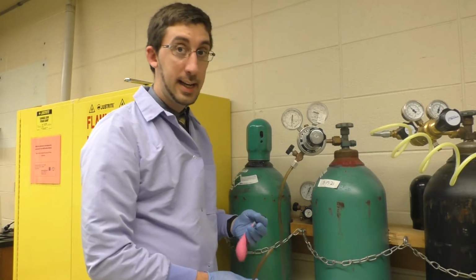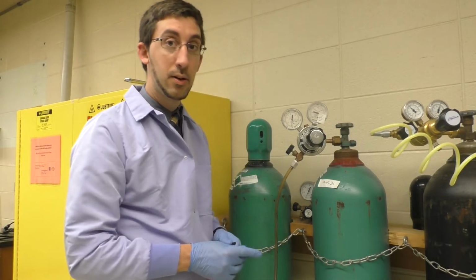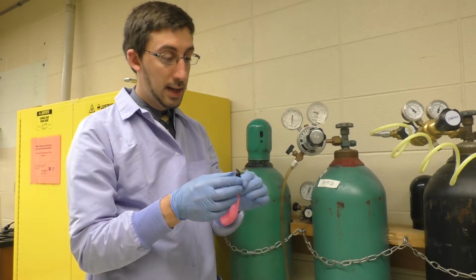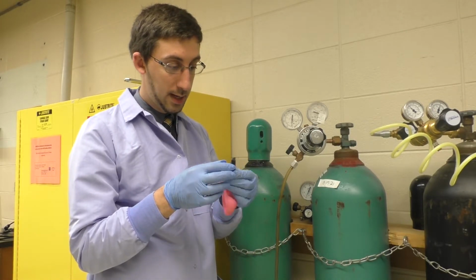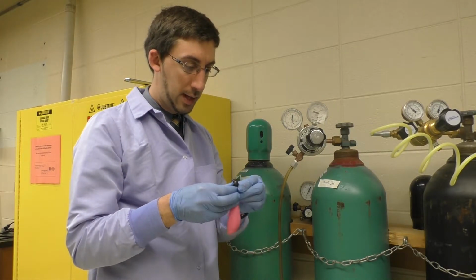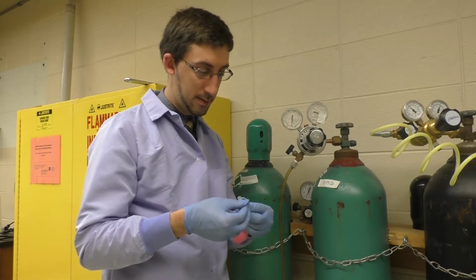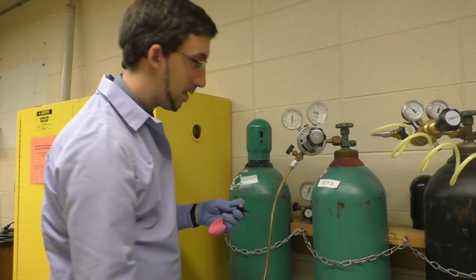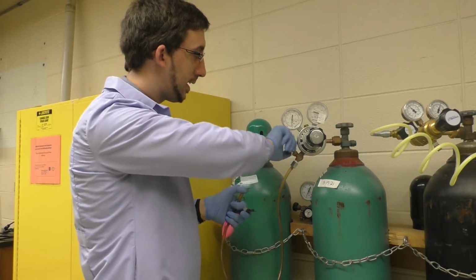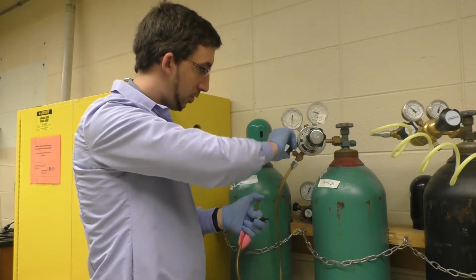Generally, I don't need a high gas flow. I'm just filling a balloon. So it may not even register on the dial. I'm simply going to carefully take my balloon and I'll uncover the one end. Got some electrical tape here to seal it off. I've got the tank open. I'll go ahead and open this side here, the little knob. Have this open.